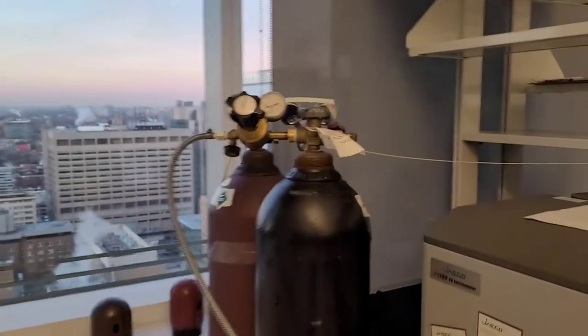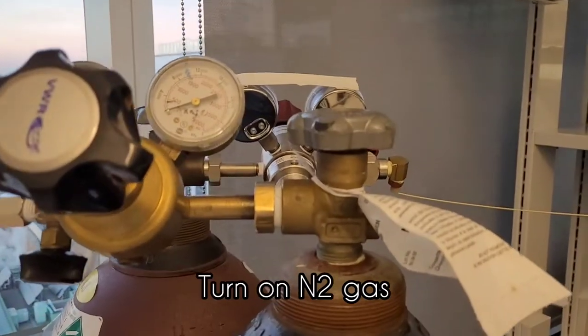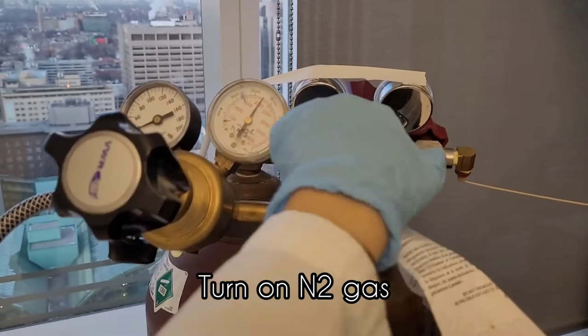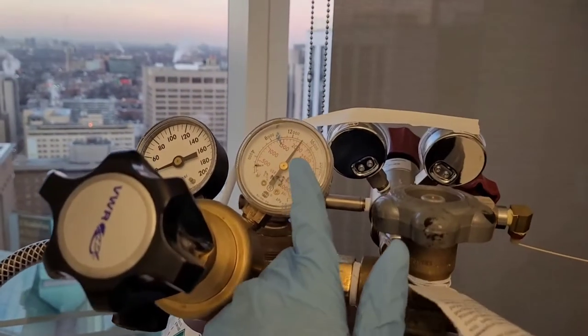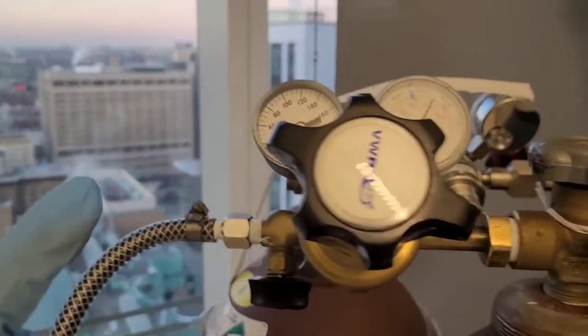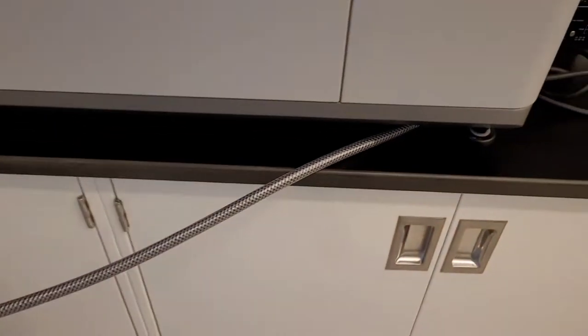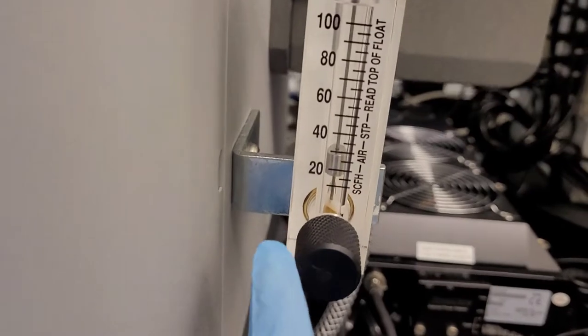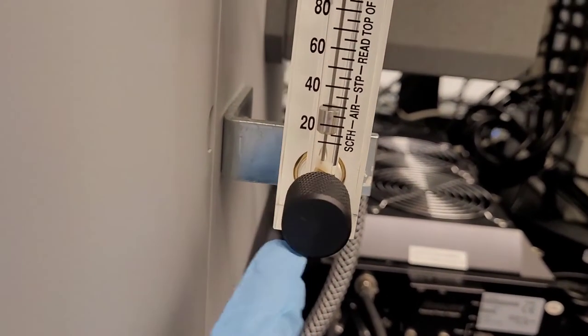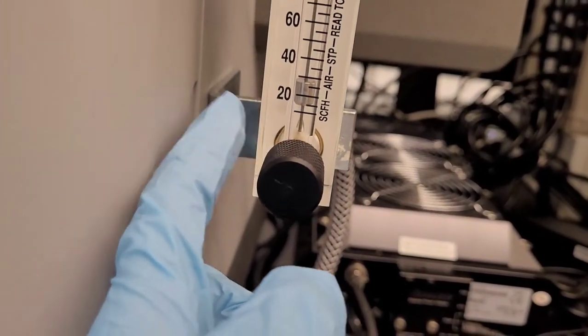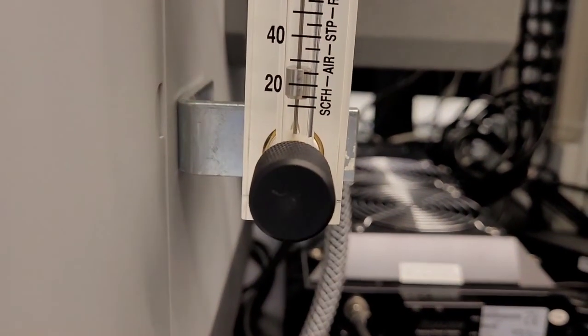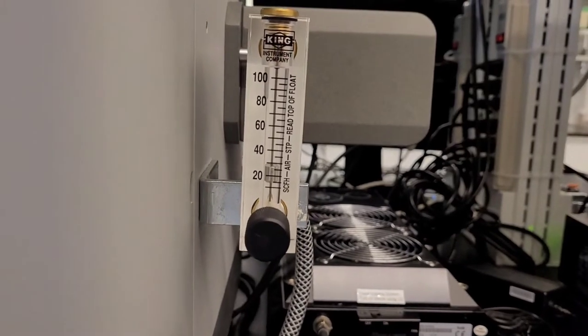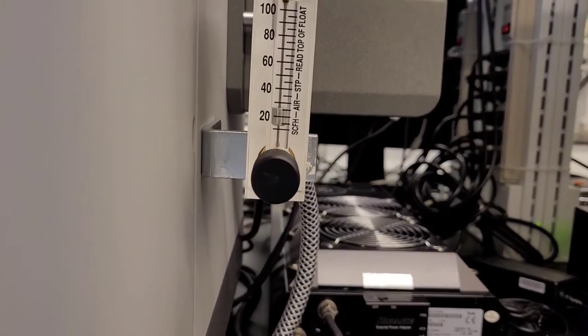So now the first thing that we have to do is turn on the nitrogen gas. And make sure that there is actually gas flowing because sometimes people will mess with these knobs and you won't get a flow read here. So make sure there is a flow and a level of 20 is good.